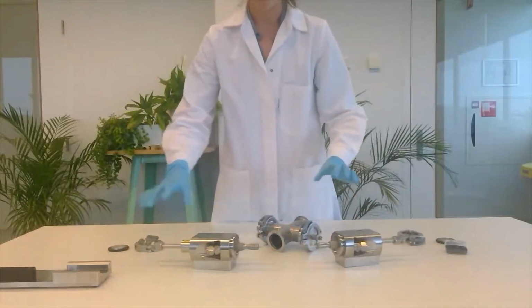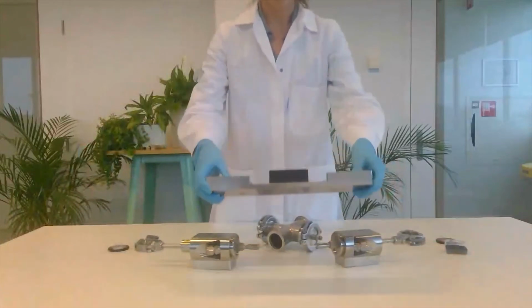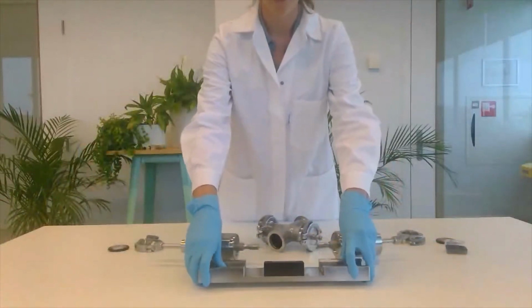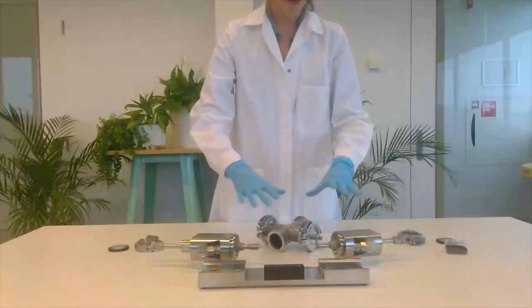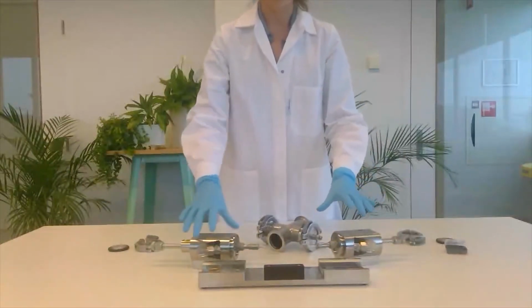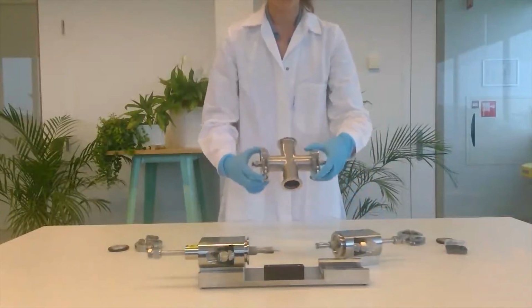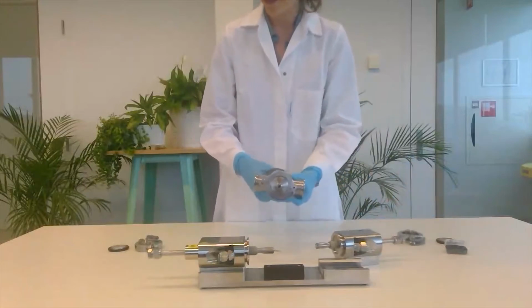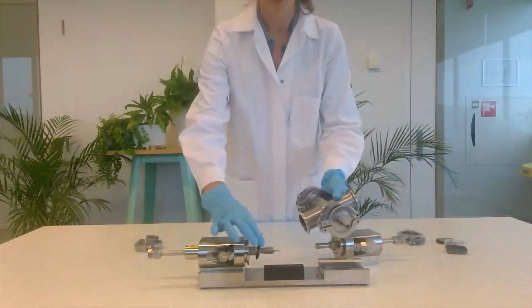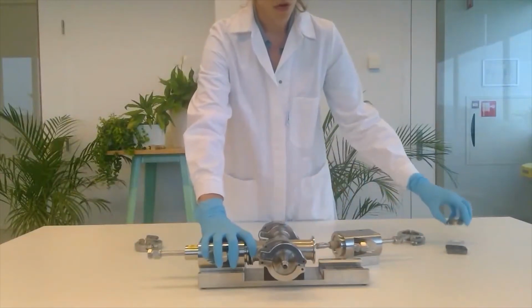Then I take an assembly stage to nicely align the reactor head so it will fit easily onto the base unit. And all we need to do is connect the two pieces with a flow piece. Connect them using an O-ring, and I do the same on the other side.